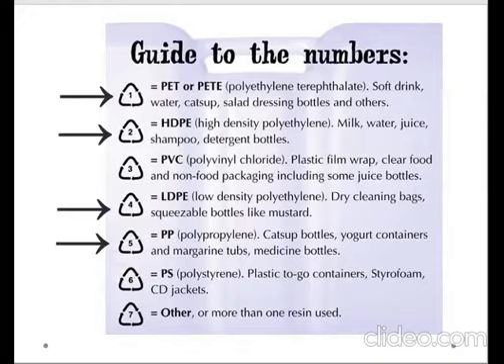So next time, bantay-bantay po tayo sa kung ano yung mga na-encounter natin na plastics. Okay? Kasi po, again, yung safety ng plastic, makikita nyo yan or ma-assess nyo yan through the numbers. And those numbers belong to what we call the resin identification code.